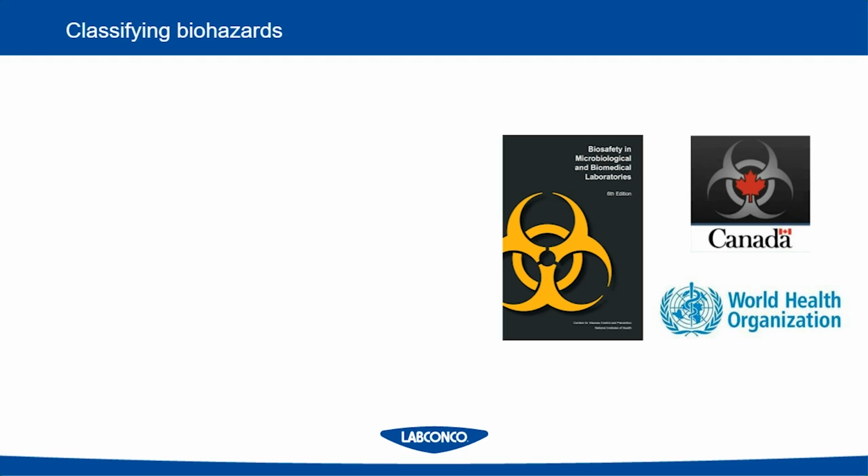Oftentimes we get people calling in saying, I have a specific hazard, what do I need to do? The first place I like to send people when they're asking about how to work with biohazards is to check with their institutional guidance. Odds are your university or your organization has either an environmental health and safety office, or you might have a biosafety officer, or if you're in a small organization, you might contract out with an industrial hygienist, and they might have a background in biosafety.